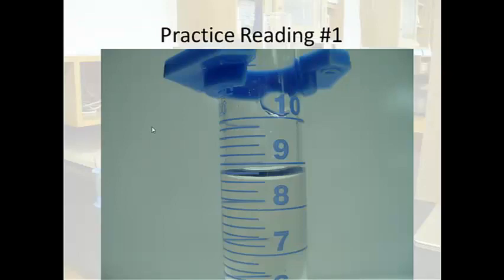Here's some practice. See if you can figure out what the precise reading should be for this graduated cylinder. I'm going to walk you through it. Here's 8, here's 9. These look like they're 0.2 milliliter increments. So that's 8.2, 8.4, 8.6, 8.8. So if this is 8.8 and this is 8.6 down here, it looks like it's a little bit closer to 8.6 than it is to 8.8. So I'm probably going to say it's 8.65 milliliters. Notice I don't think it's exactly in between. If I thought it was exactly in between, if I thought the meniscus was right here, I would have said 8.70 milliliters. One of the keys here is this. Since this measures to the tenths place, I want to make my measurement out to the hundredths place. We'll explain why that is later, but that's important for right now.